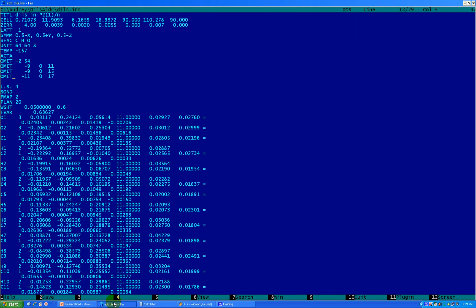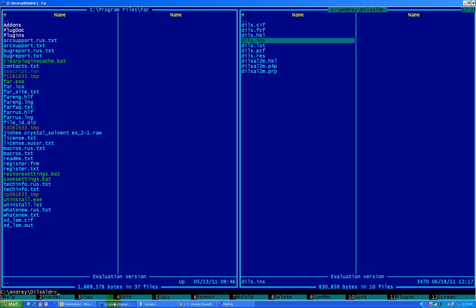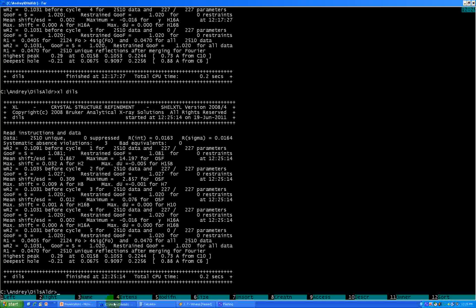After you finish typing OMIT here, go and escape and save it. The next thing what you do is just do the refinement. You can clearly see that it's helped us to decrease somewhat our GOOF. It's decreased somewhat of our factor, decreased somewhat of our peak, so it doesn't help us that much. The next step what you can do, you can even further improve your structure by continuing playing with the weight scheme.